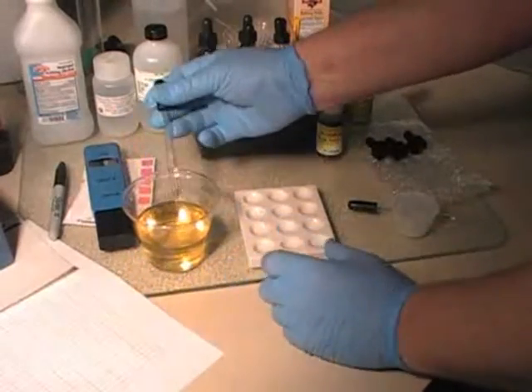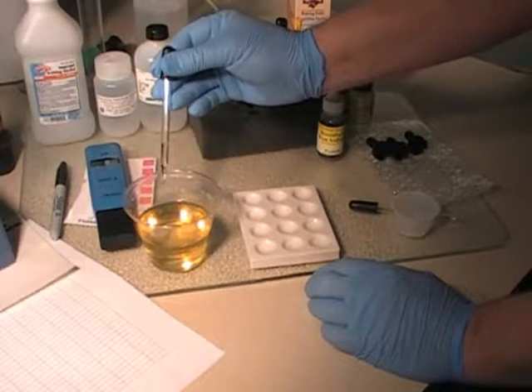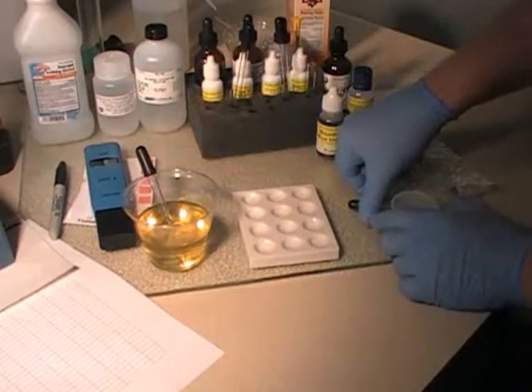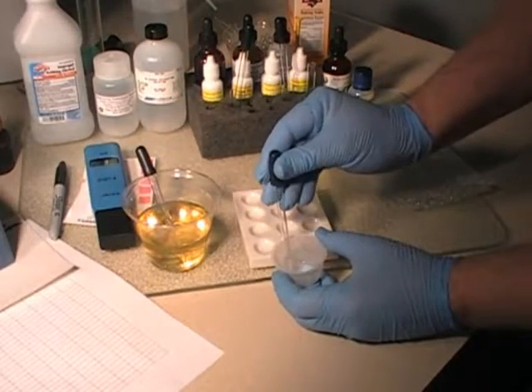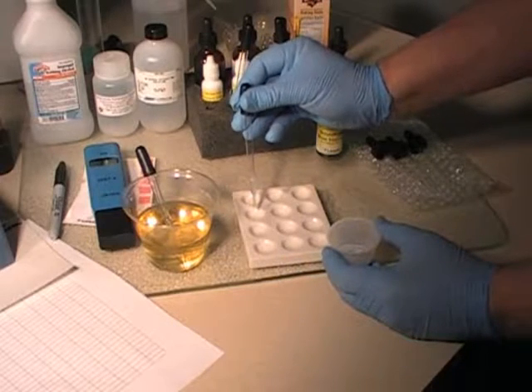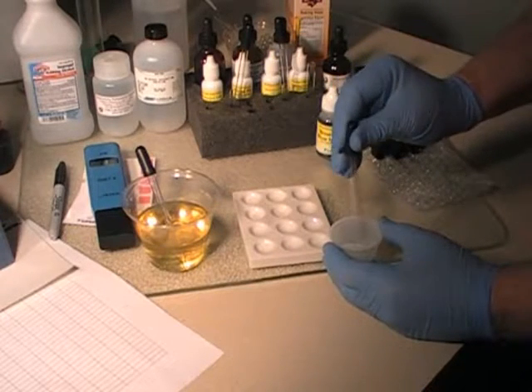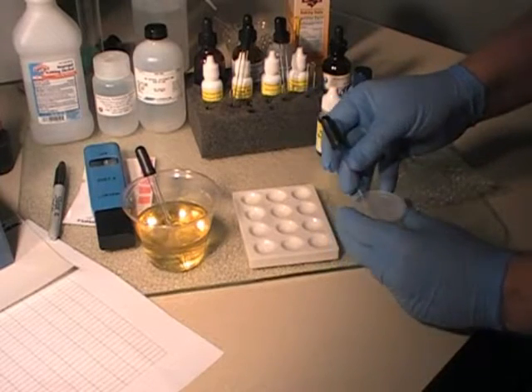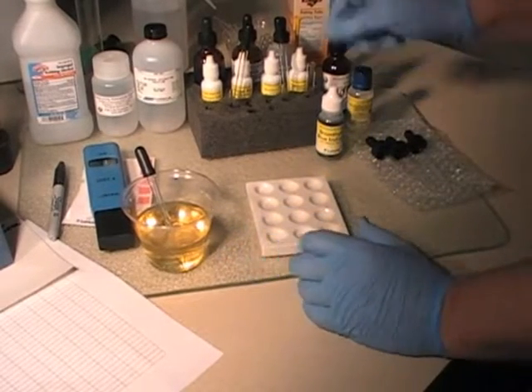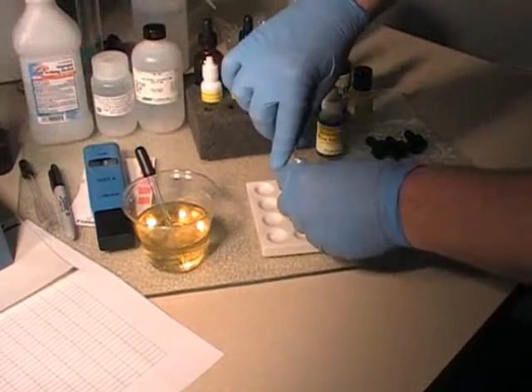So we pull some urine up, and we're going to drop one drop of urine into well 1 and well 2. We're then going to take the pipette for the saliva, pull some saliva up into it, and put a drop in well number 4, and a drop in well number 5. And this actually should be gotten rid of now. I'm going to move these out of the way, out of the block here. Maybe they were just extras. We're going to put these over here for now.